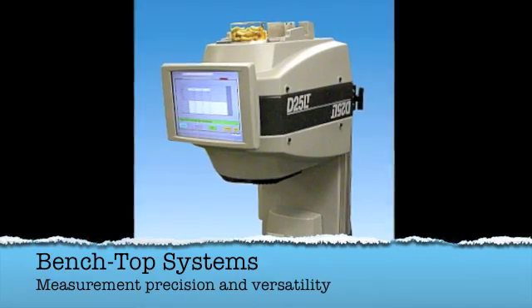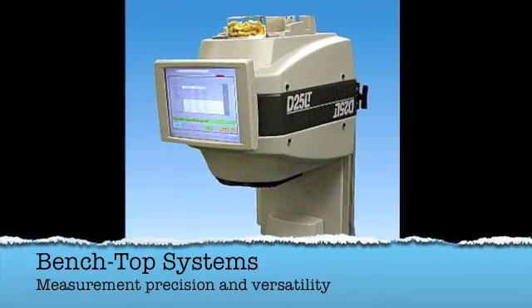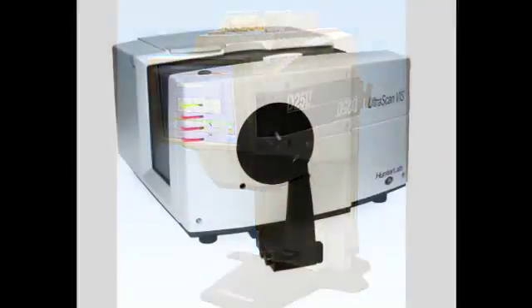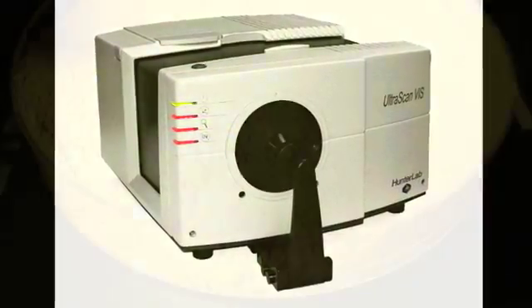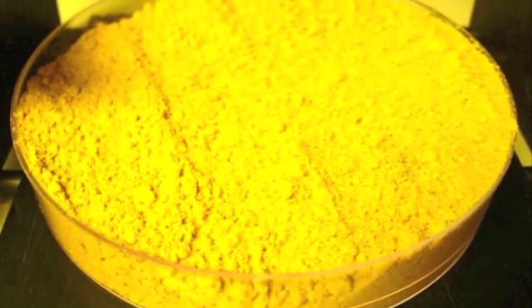There are also numerous types of benchtop systems, varying depending on your exact function. The beauty of the benchtop systems is that they maintain the perfect balance between sample measurement precision and versatility.